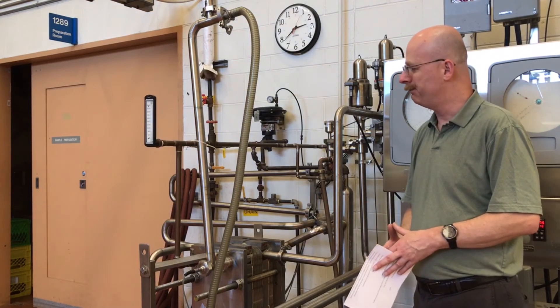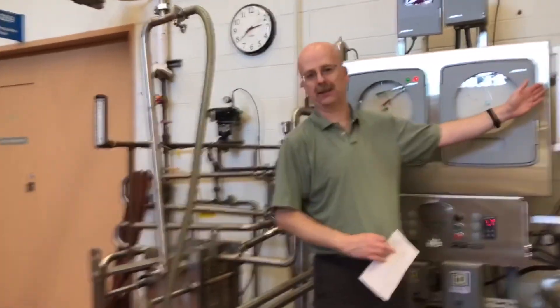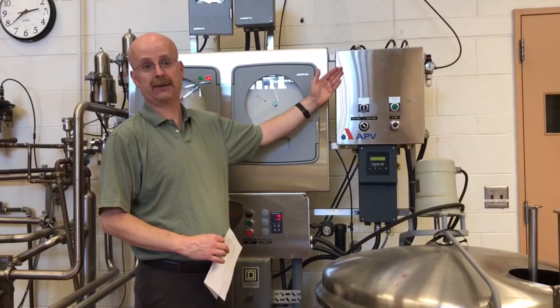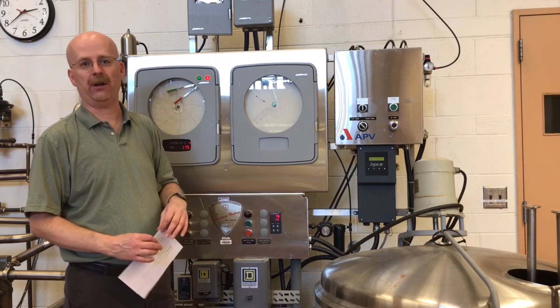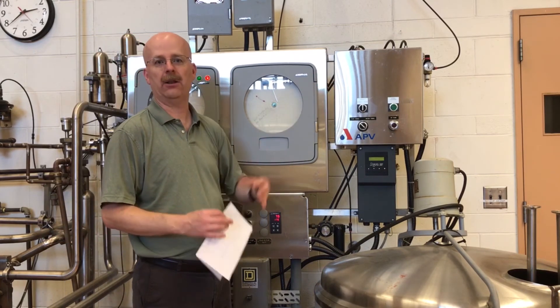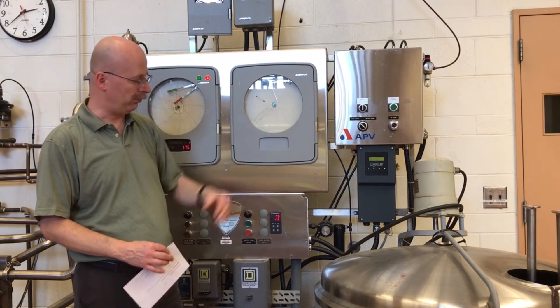The final piece of our system is our CIP system — a separate clean-in-place system which has its own pumps. This is where we can run caustic-type solutions through the system at the end of the shift. I'm not going to cover that in any detail, but I just wanted to point that out.